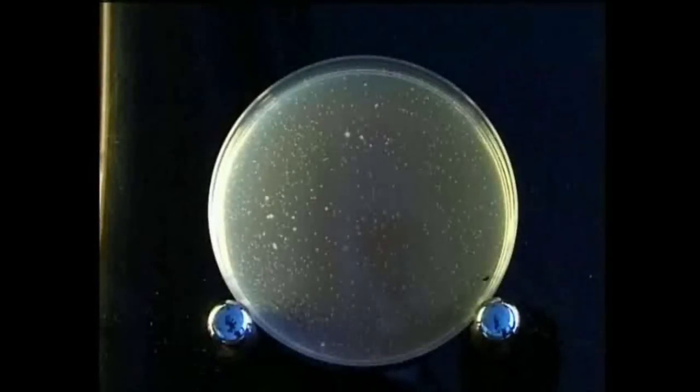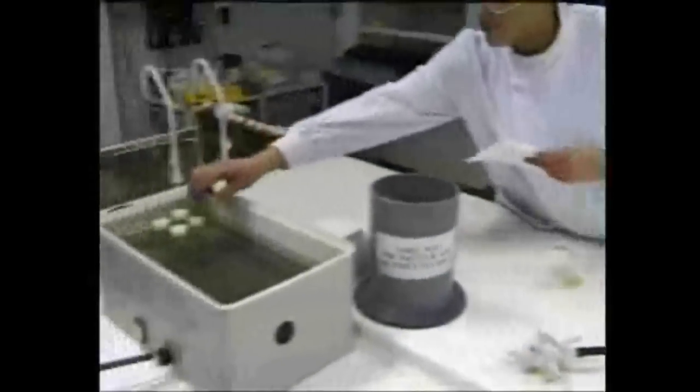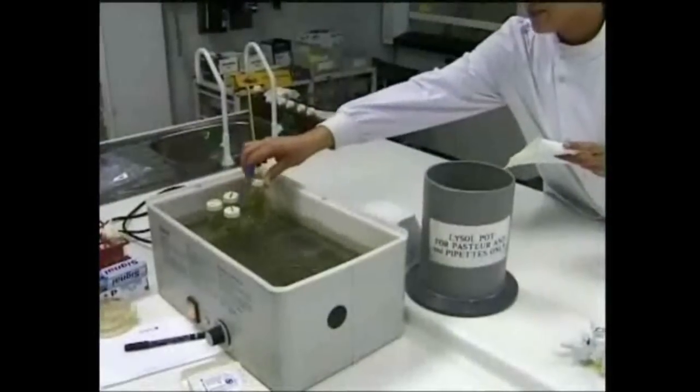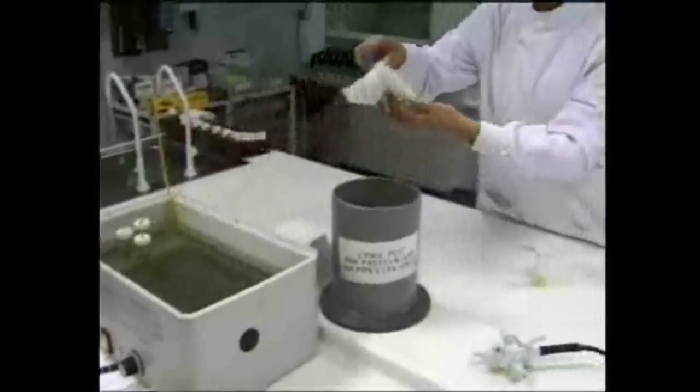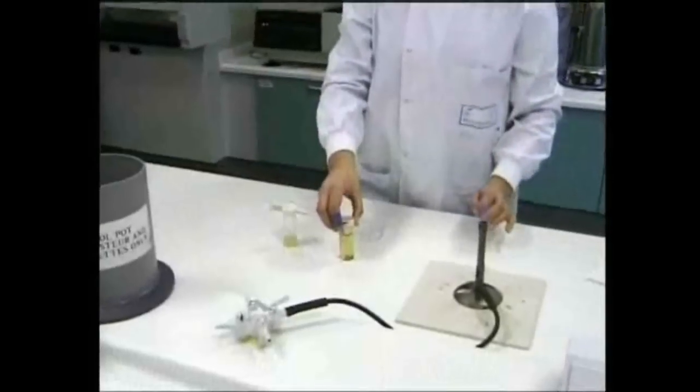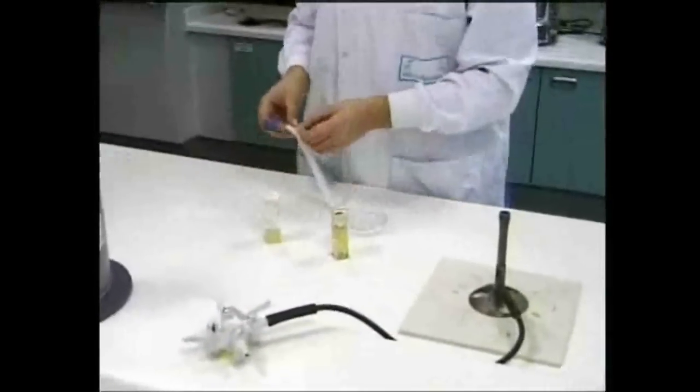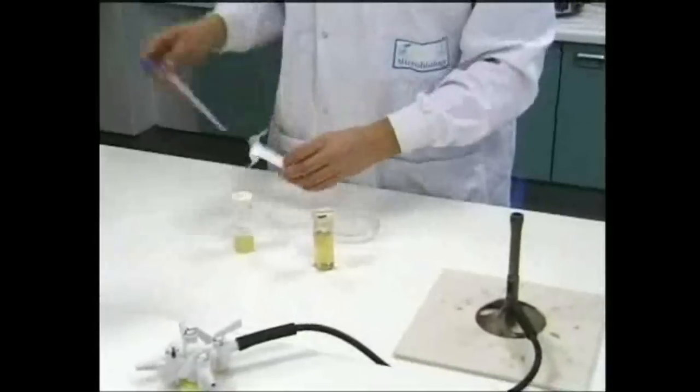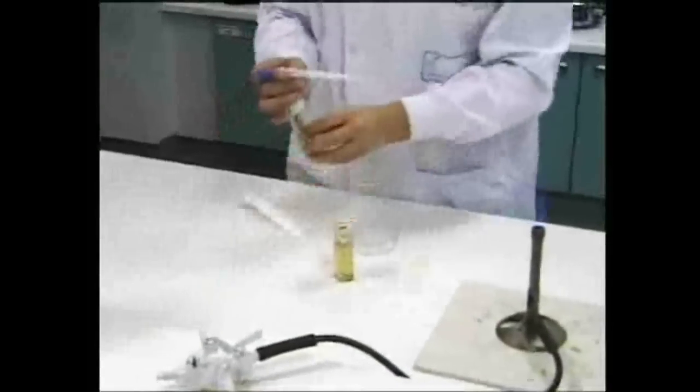The pour plate technique can also be used to isolate single colonies. It's easier to perform than streaking, and consists of inoculating the culture into a sterile tube or bottle containing about 15 cubic centimeters of molten agar at 45 degrees Celsius. The suspension can't be too concentrated, otherwise confluent growth will be obtained rather than isolated colonies.